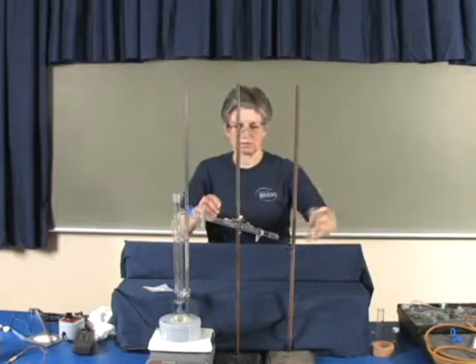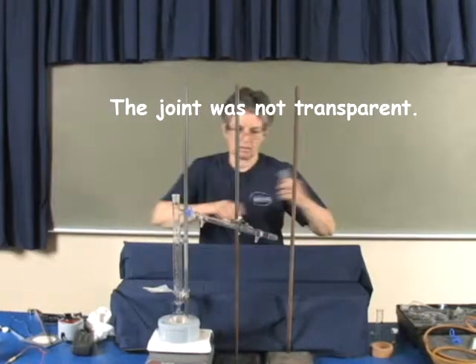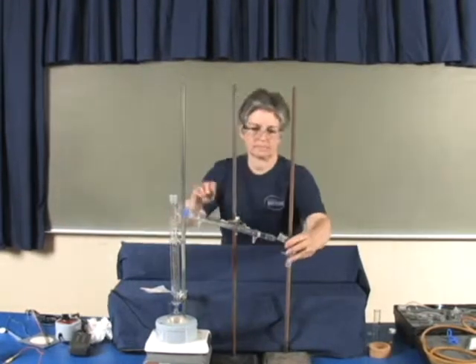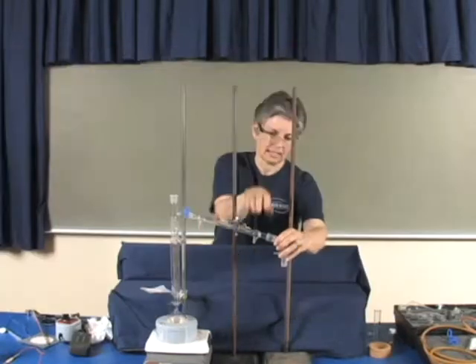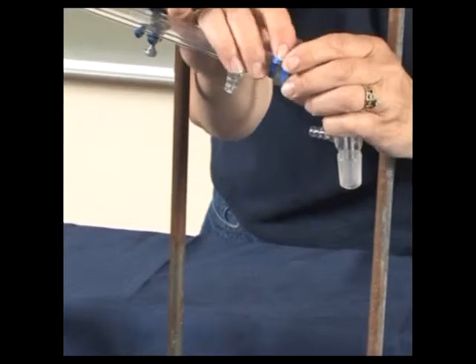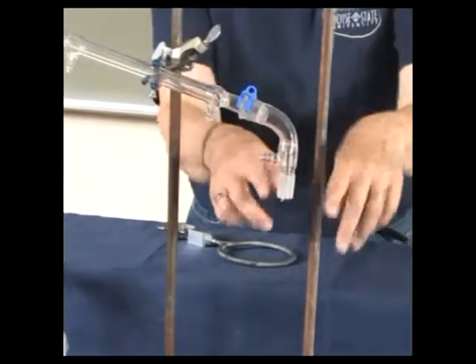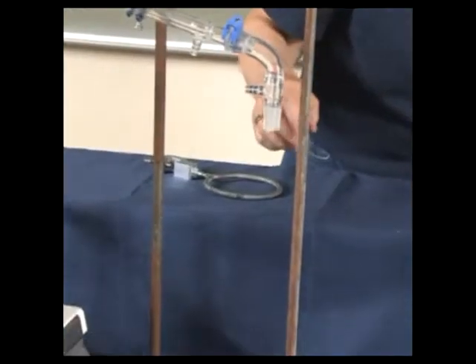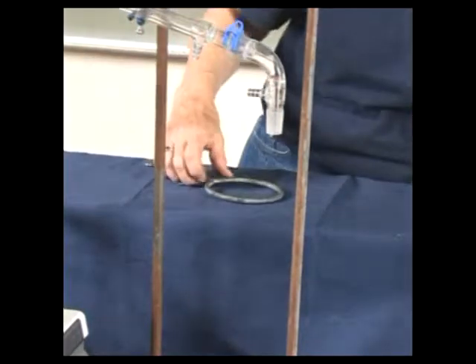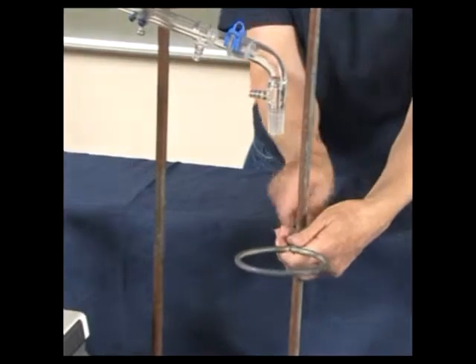The vacuum adapter goes on next. Again, secured with a keck clip. The receiver goes here. Another round bottom flask could be used as a receiver, or a graduate cylinder so the volume of the distillate can be measured.